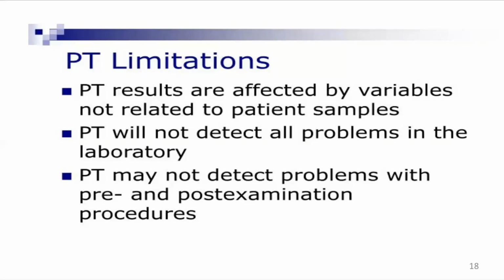There are so many things, so we have to consider all those things. But PT is a useful tool if you are acting fairly in the PT, so it gives you confidence. But sometimes it may not be able to detect problems with pre and post examination procedures, as we discussed.